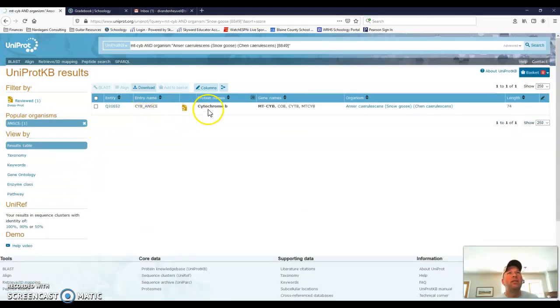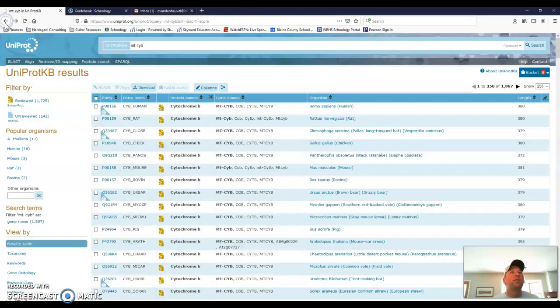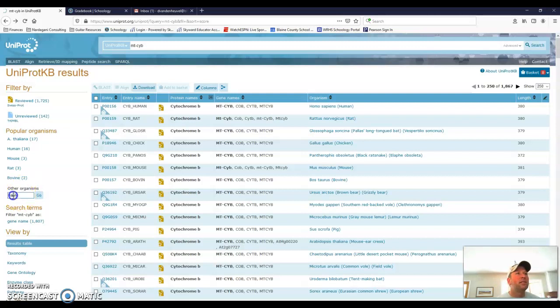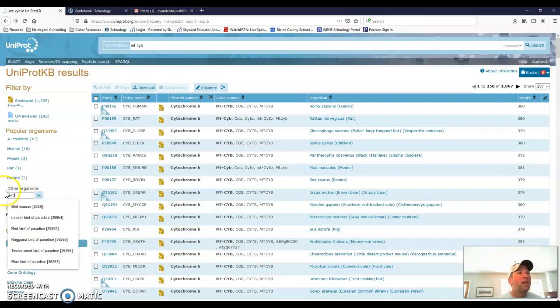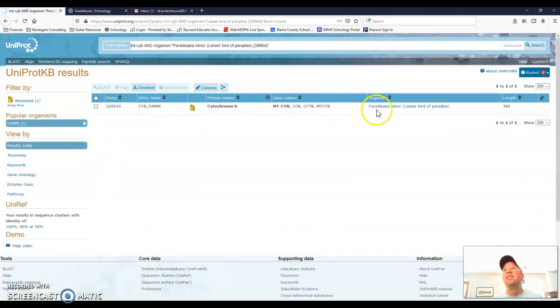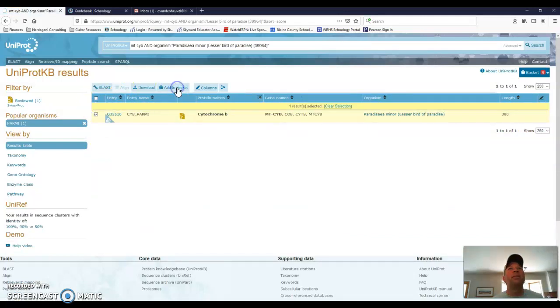And here it is. Now it says cytochrome B, MTC-YB. But look at the length. It says 74. So that's no good. I can't use that one. That's the wrong length. It's some other kind of data. So I would have to click back and find something else. So let's say, are there any hawks in here? Nope. Eagle. No. I'm just going to say bird. Lesser bird of paradise. Perfect. Okay. 380. Everything looks good. So I will add that to my basket.